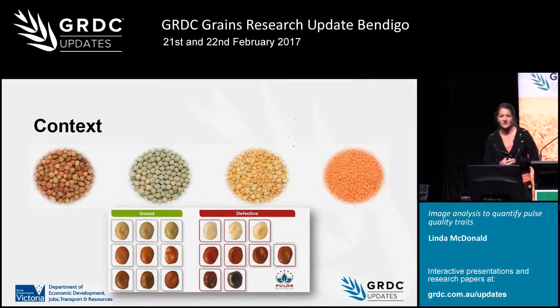So the context of my project is in the visual appeal of pulse grains. I'm interested in the colour, size, shape, as well as defects and harvest damage, contamination in samples, that sort of thing. But a lot of those traits are really subjective to measure. You might be familiar with the process of comparing a grain sample to standard colour charts.